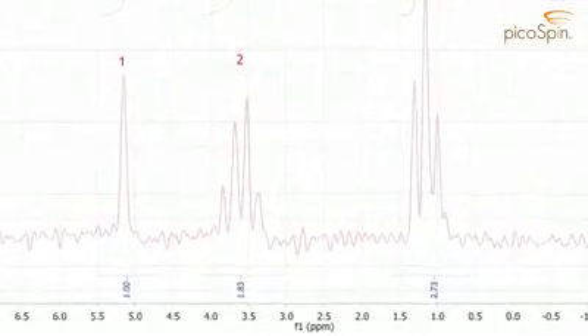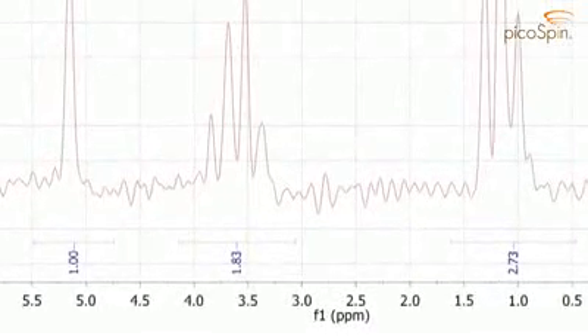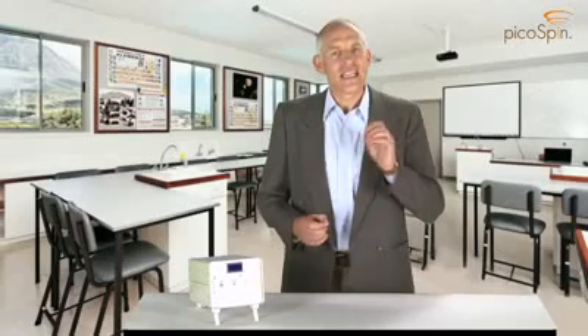And finally, the line integrals are proportional to the number of protons of each kind, demonstrating the quantitative nature of NMR line intensities. Let's take a closer look at some of the specifications.